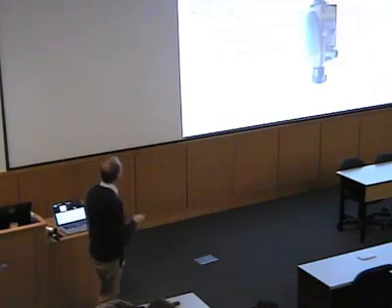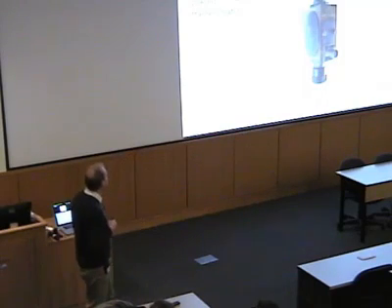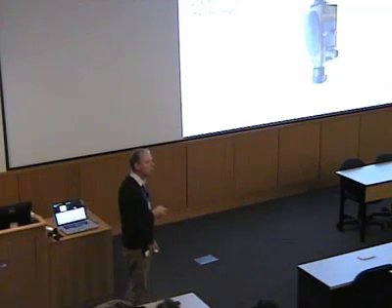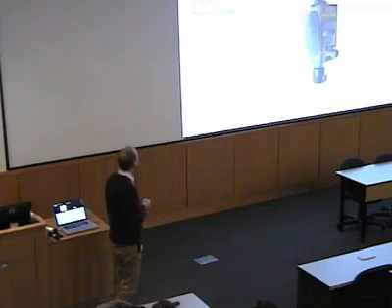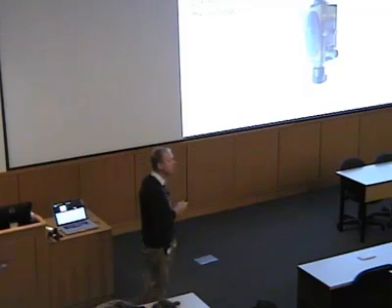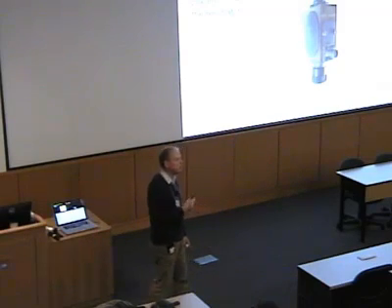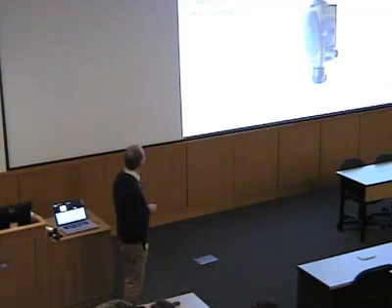Okay, but on the previous slide, I said we use this lock-in detection. There was something about 100 kilohertz modulation and so on. So even if we're using a resonator, we still have to struggle with weak signals in EPR. And so we use a different detection method. And this is a really important method for enhancing signal to noise in any kind of experiment, and is actually often used in optical spectroscopy as well.